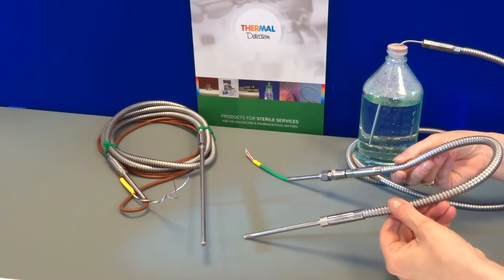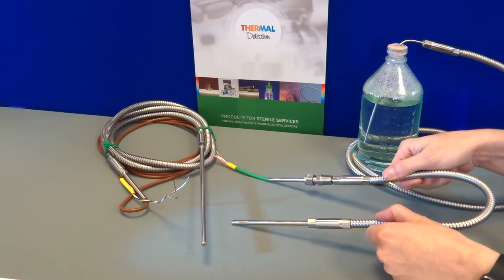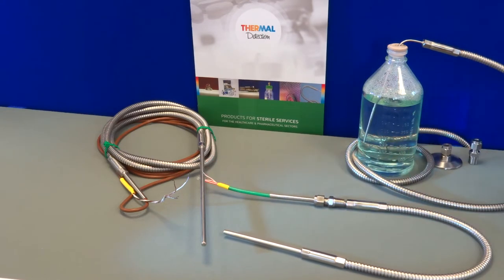The conduit or armour is double interlocked for flexibility and also for mechanical strength, and the conduit protects the cable beneath during loading and unloading.